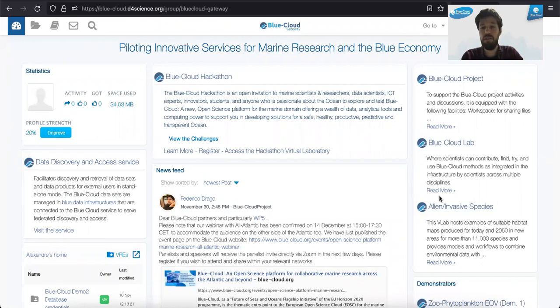I am a postdoc at Sorbonne University, and today I'm going to walk you through the Plankton Genomics virtual lab, especially notebook 2, called Projecting Plankton Functional Gene Clusters, that you will use for the topic Understanding the Ocean of the Blue Cloud Hackathon. I will go quite quickly through this video tutorial, where I will explain the different R pipelines and habitat modeling and mapping tools that you will find in this notebook. All the examples have already been run, so I spare you the waiting time.